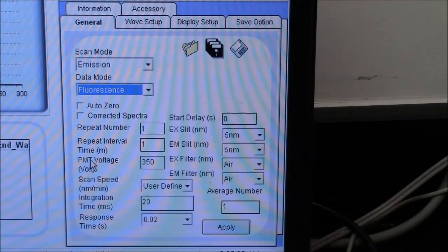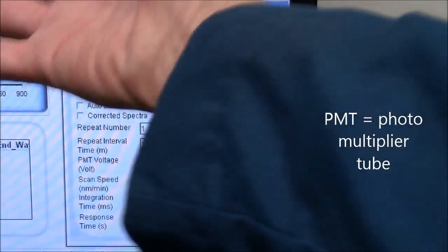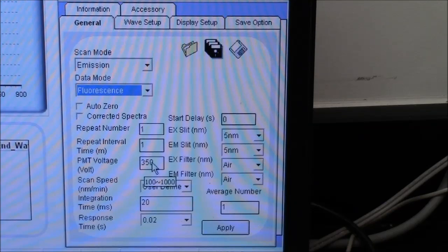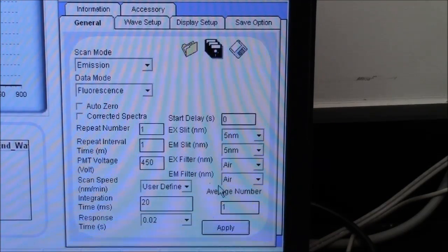PMT is photomultiplier tube, and depending on this voltage it controls the sensitivity of the machine, rather like a volume control. Crank up the PMT voltage and you'll get a higher spectrum reading. I will adjust this to 450 volts, which I believe will be an appropriate measurement for this sample. I'll hit apply.